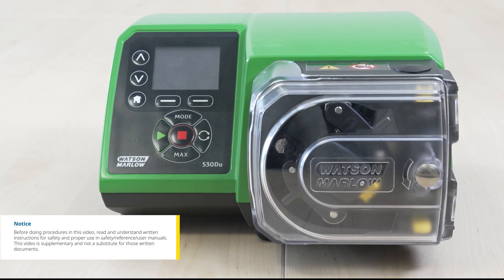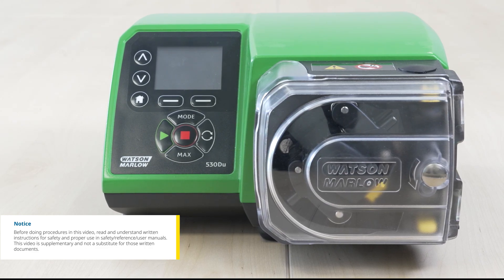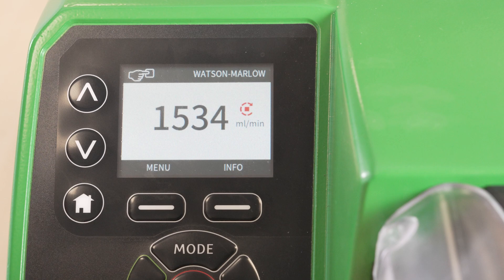In this video we'll show you how to configure the digital inputs and outputs of the Watson Marlow 530 peristaltic pump. With the pump on, we will begin by configuring the digital inputs.